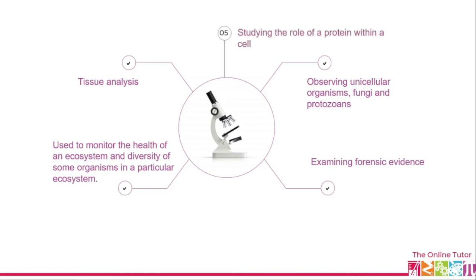Now we also use the microscope in studying the role of a protein within a cell. For the biochemists that mainly focus on the importance of proteins within cells and their chemical reactions, we use very powerful microscopes to study the role of proteins within cells in the laboratory or the research labs. We also use the microscope in studying atomic structures, and more often the structure of rocks.